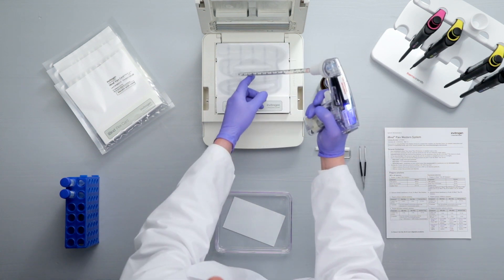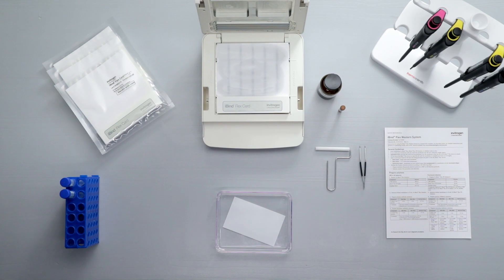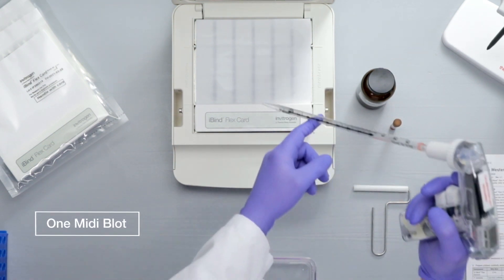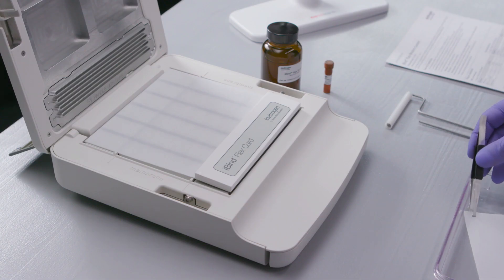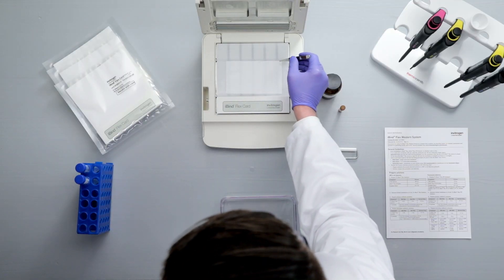Once wet, alignment guides will show through the card. Use them to ensure proper alignment of mini blots or vertically cut strips with their respective wells. To process a midi blot, make sure the midi well insert is installed. Then add an additional 2 milliliters of 1X iBind solution to the card, allowing it to pool. Place your blot protein side down across the membrane region indicated on the device, with low molecular weight bands closest to the stack.